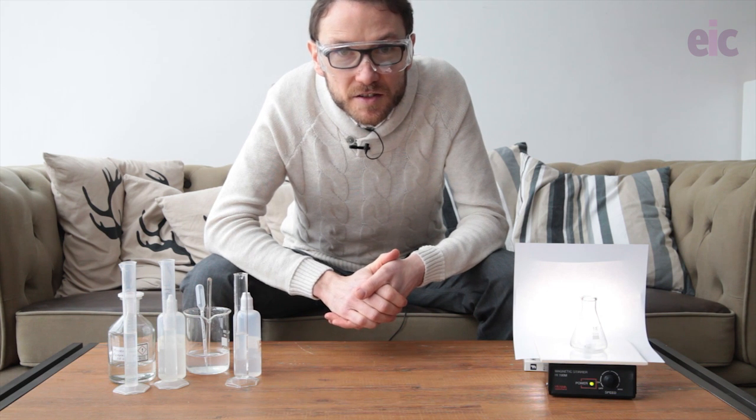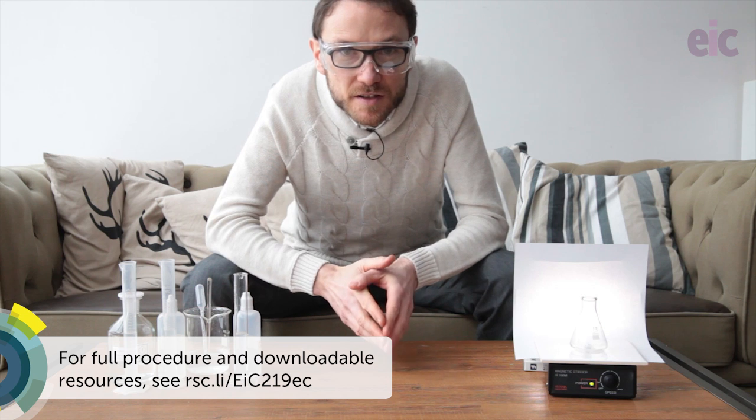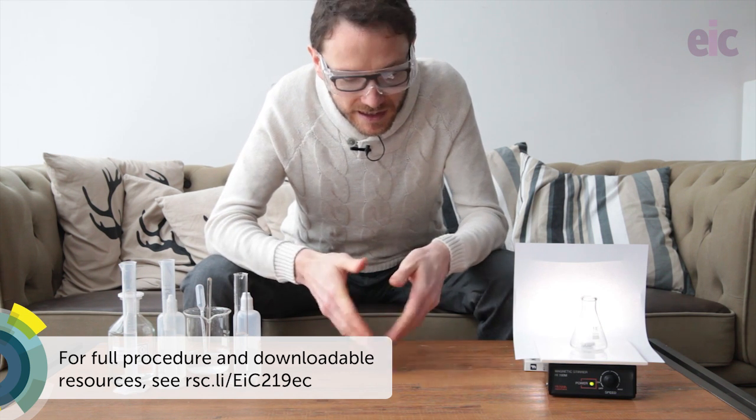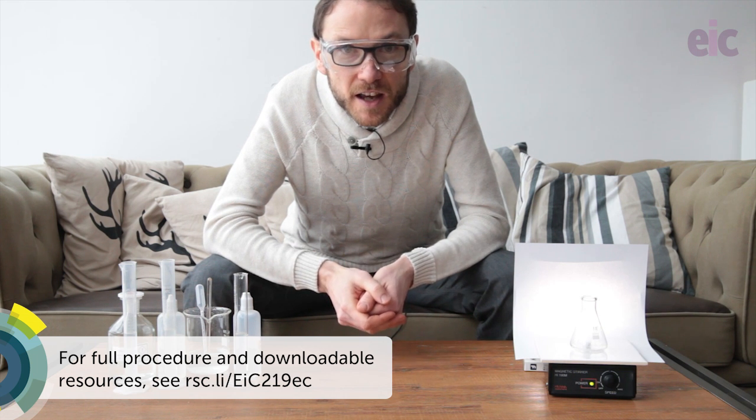The final solution has some malonic acid. The full ingredients for all of the solutions are available in the links below on the EIC website, along with all of the safety information.